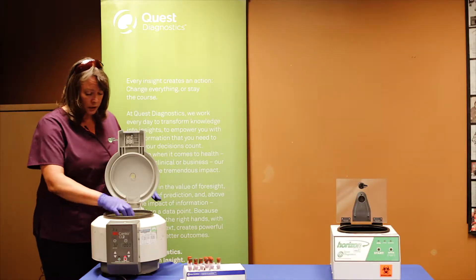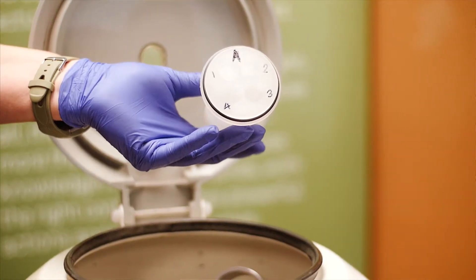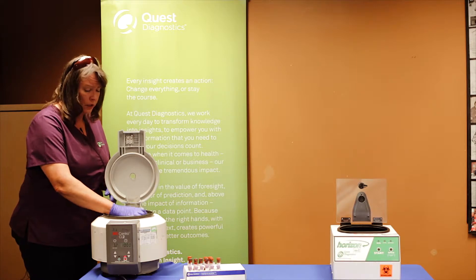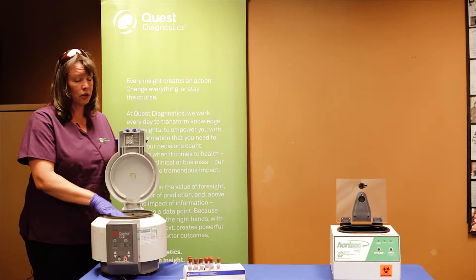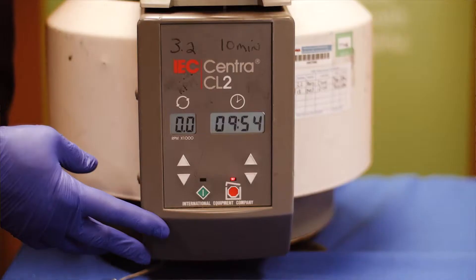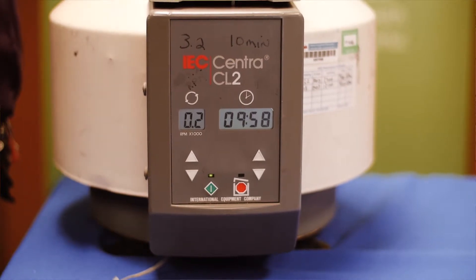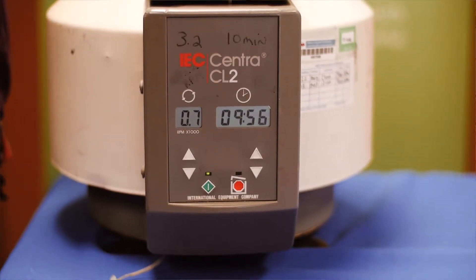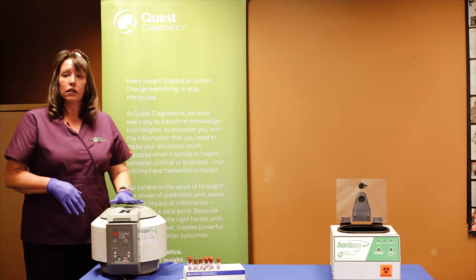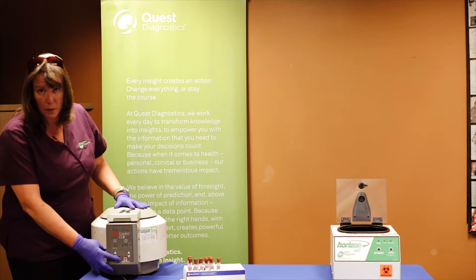When you load this machine, we have cups in the bottom here that are marked A1, 2, 3, 4 and B1, 2, 3, 4 to help you when you are loading the machine, making sure that those samples stay in order as they go. Once you close the lid, you hit the green button and it will start and time down to 10 minutes. When the machine stops on its own, the lid will automatically go green again and you can hit the button to open it up.